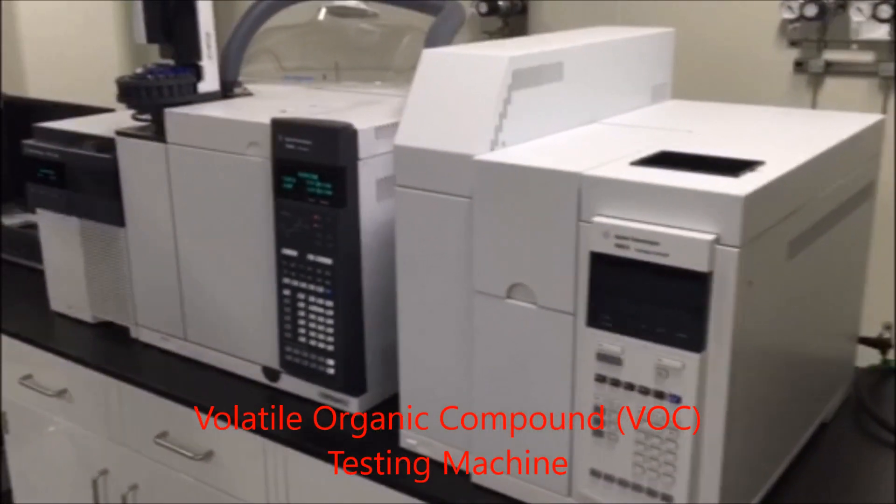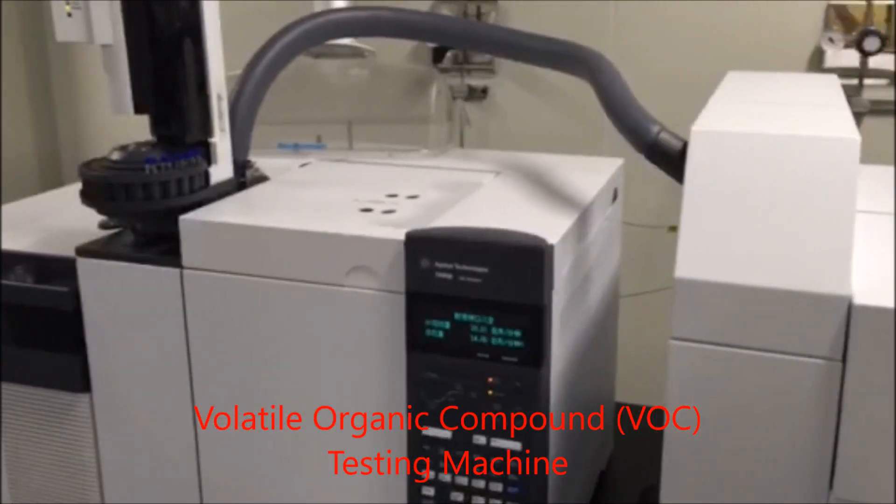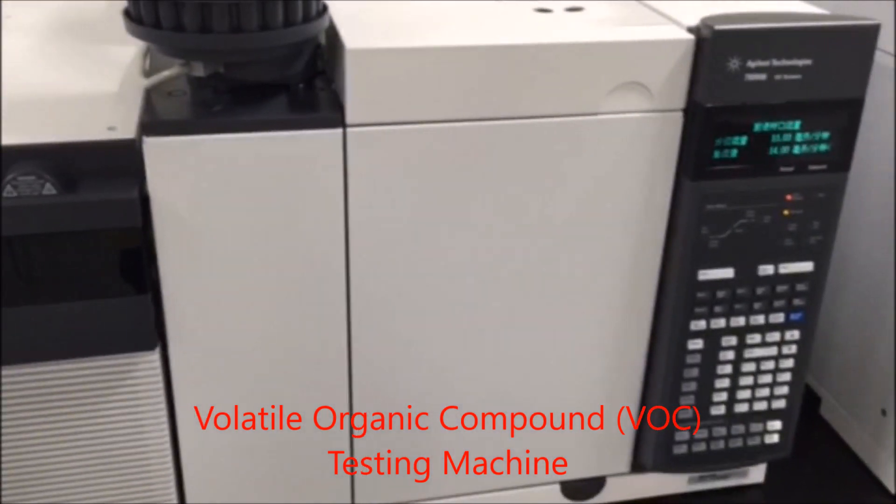This is a VOC testing machine. This will actually test the off-gassing and the chemicals that are in any product.